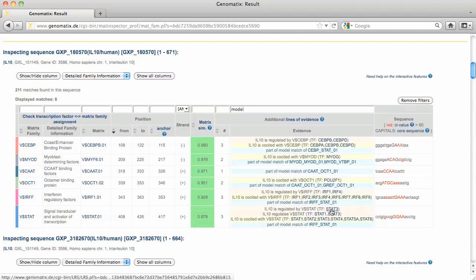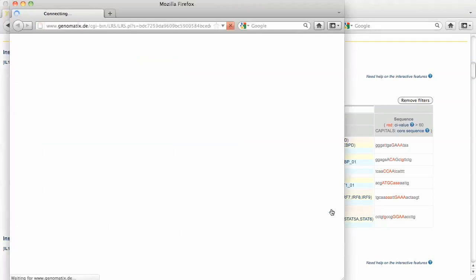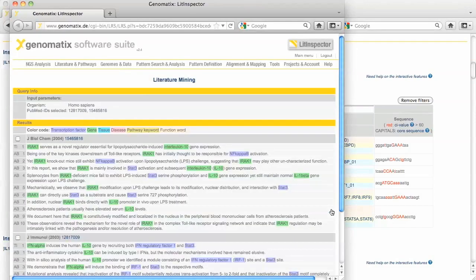Follow a link to the corresponding transcription factor in the evidence field to display the citation supporting the functional relationship.